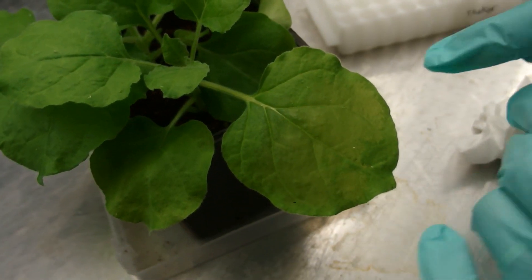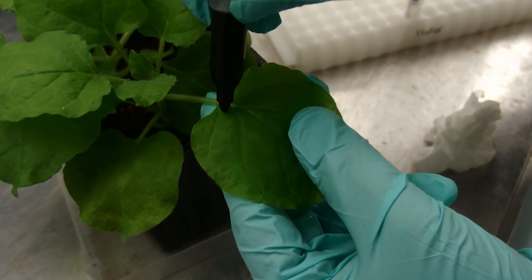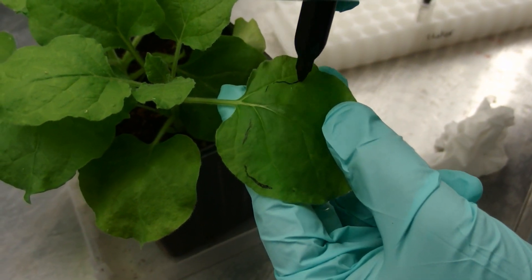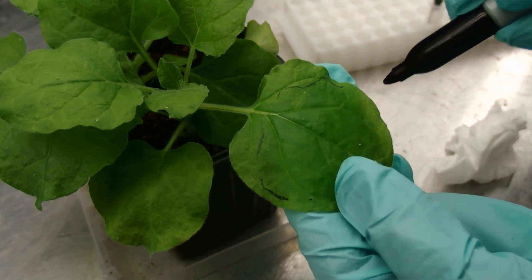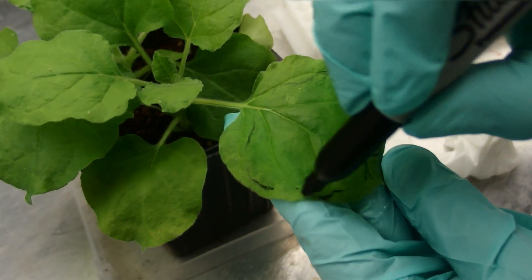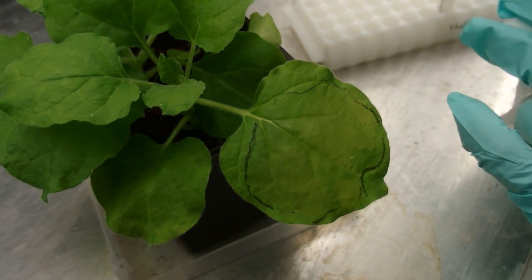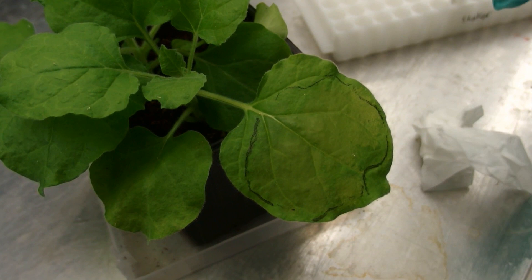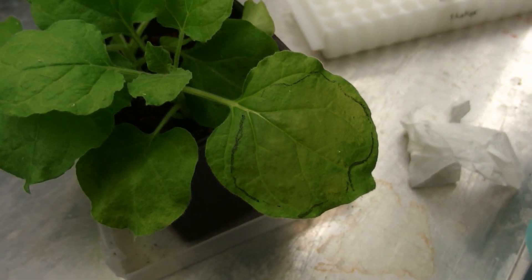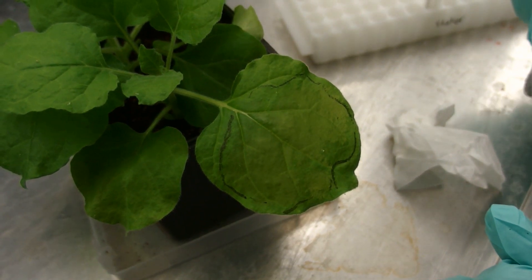Now we are going to mark the area that was infiltrated, because that is the tissue where our gene is going to be expressed. We are going to wait for two days to observe the gene expression under a fluorescent microscope. After two days, good GFP expression might look like this.